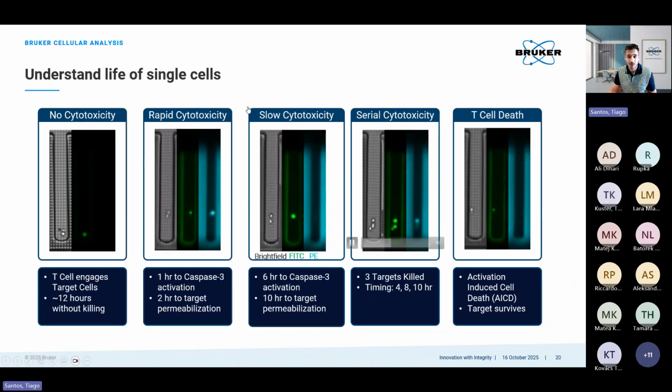One researcher actually in Slovenia, in Ljubljana, mentioned that one of the key things is also not just looking at the capacity of killing, but after the CAR T killed the target cell, understanding if it is able to be motile and go and kill another cell. That's super important to really see if it is persistent, if it can resist then in the patient and resist exhaustion.